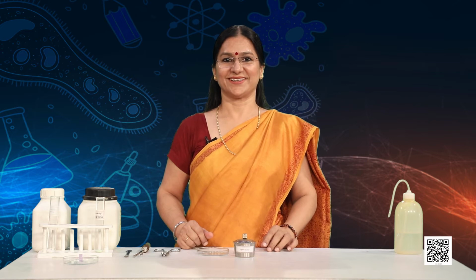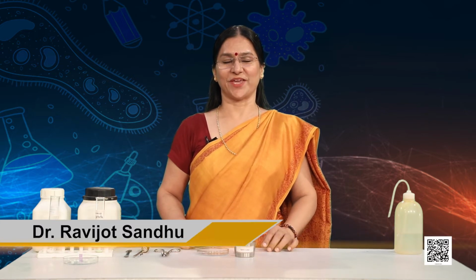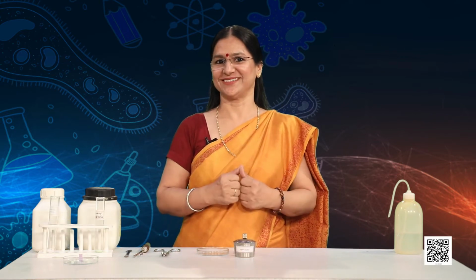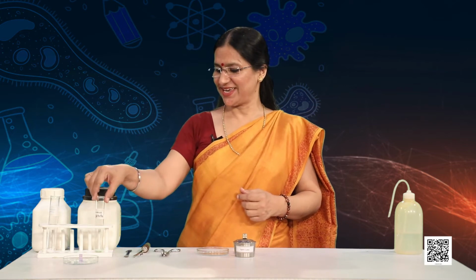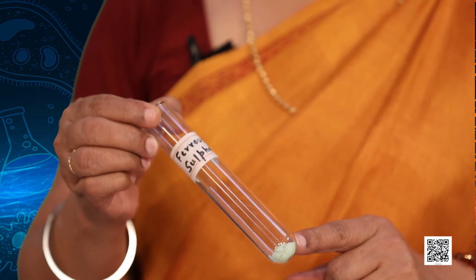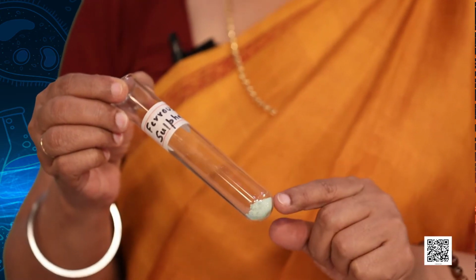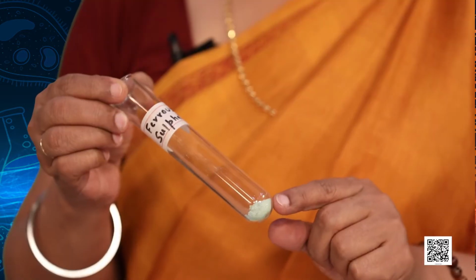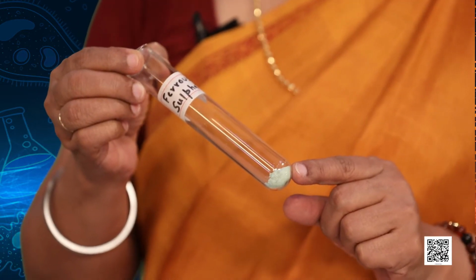Hello young friends, we are discussing types of chemical reactions. So far, we have discussed combination reactions. Let's explore further. As you can see, in a boiling tube, I have taken 2 grams of ferrous sulfate crystals. I want you to note the color of the ferrous sulfate crystal. Aren't they light green in color?